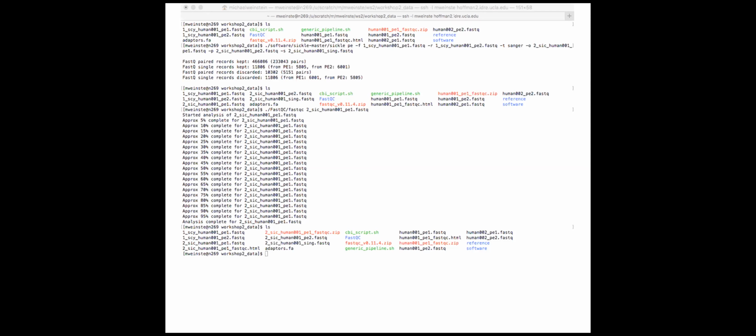All right, so you're getting a message saying no such file or directory. So that would mean that you're either trying to run from the wrong folder, or you didn't do a make on your sickle program.